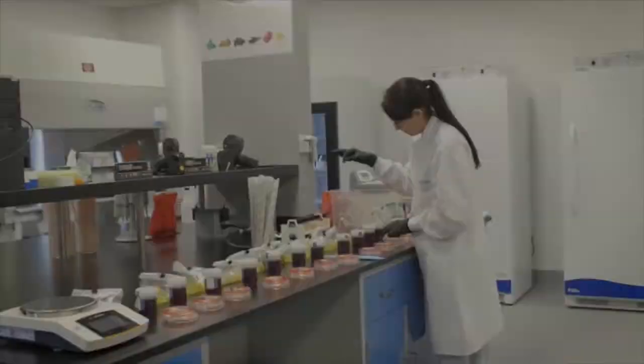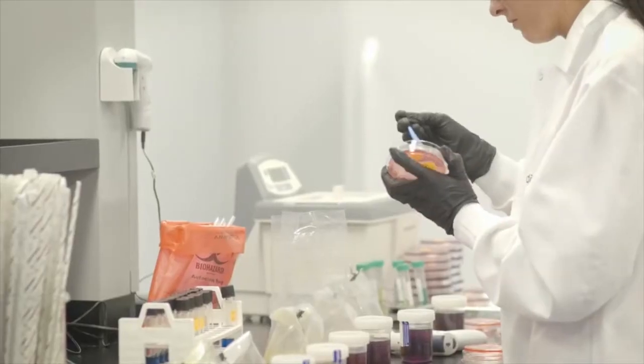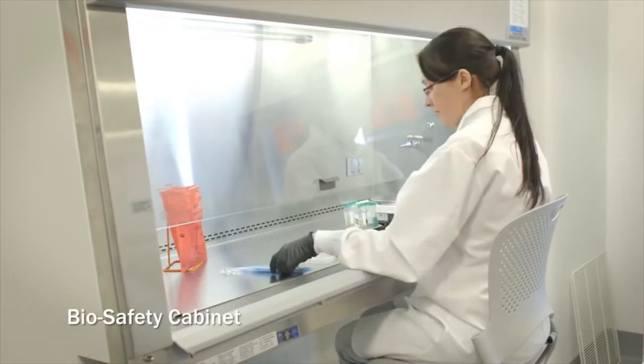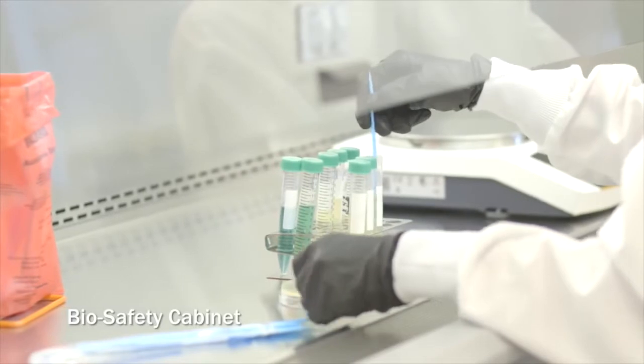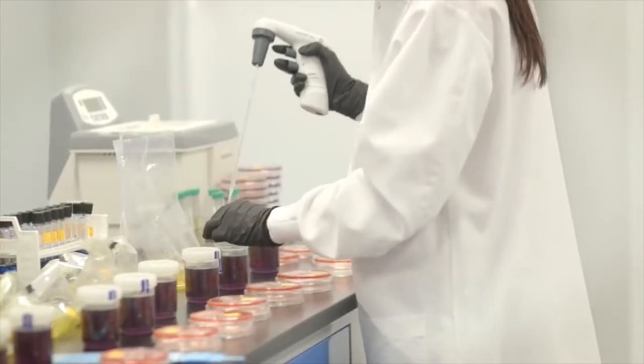Part of our contamination testing we have on our essential oils is each one will go through a variety of microbiology tests. In the microlab, we test for total plate count, and yeast and mold, and salmonella, and E. coli, and Pseudomonas. The microbiologist will swab and plate each media, and then they'll actually count the plates using some specific microbiology techniques. From these tests, we can actually measure the contamination that has been possible in any part of the manufacturing process, all the way back to distillation.